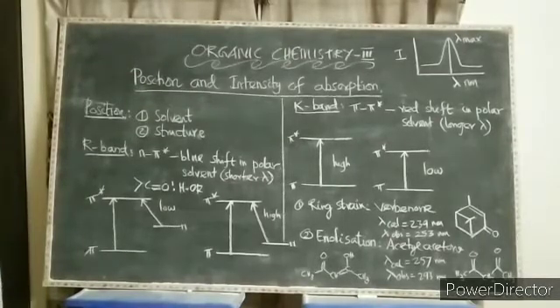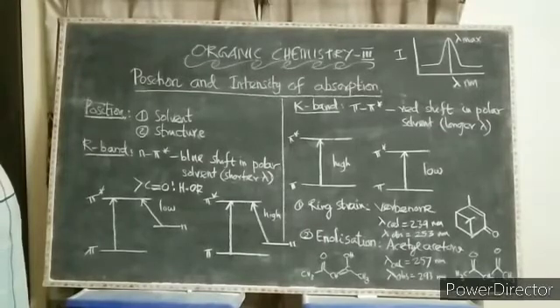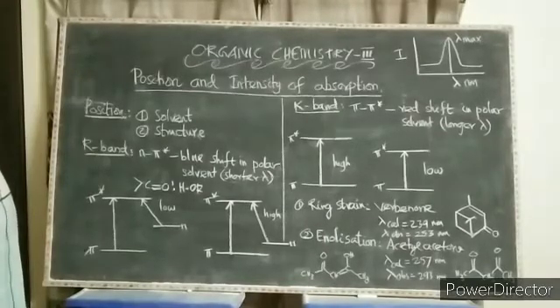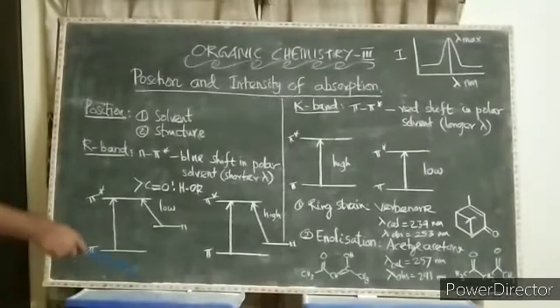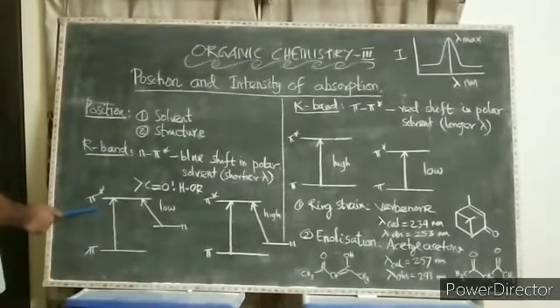So, we can draw a schematic in order to represent the energy aspects of the sample.